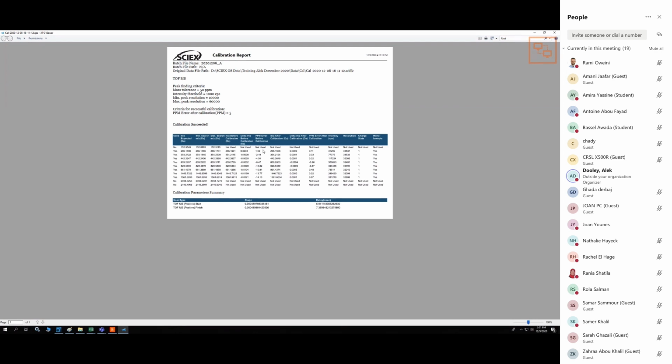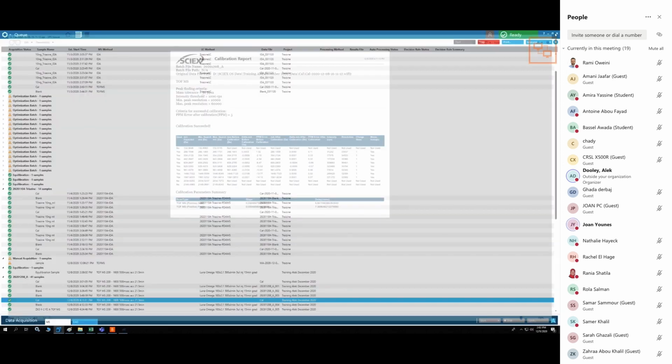But we did equilibration, right? We did about 30 minutes of equilibration while we were typing the batch. So I am a little bit surprised by that, why it's so much. That to me would be something after 1 month, I would see those numbers. Let's check the next one.